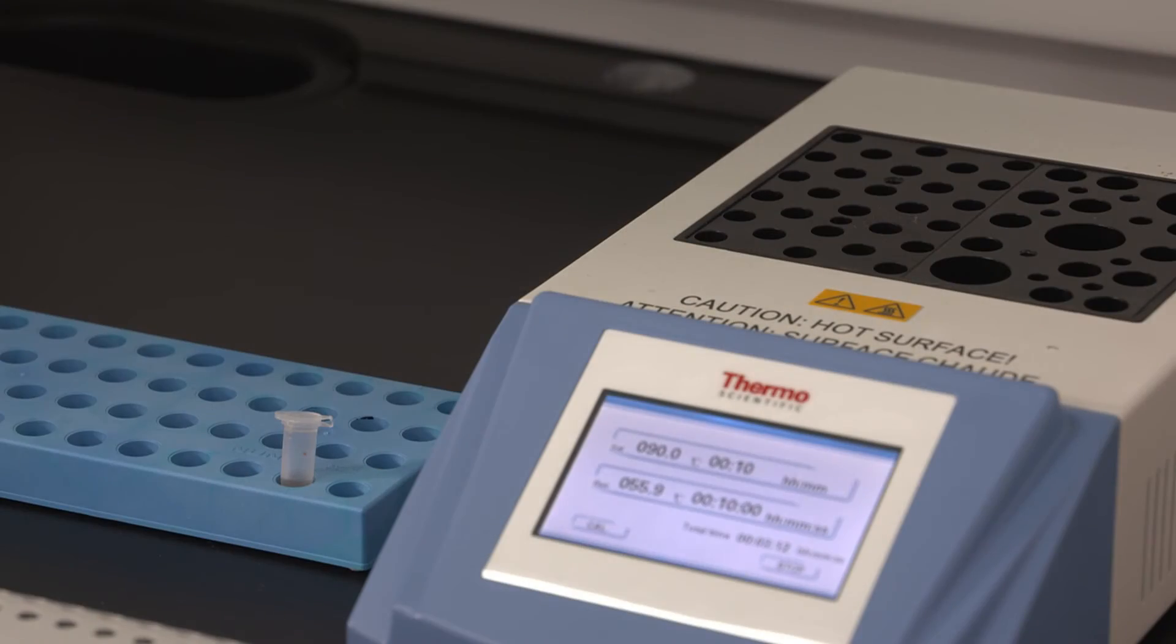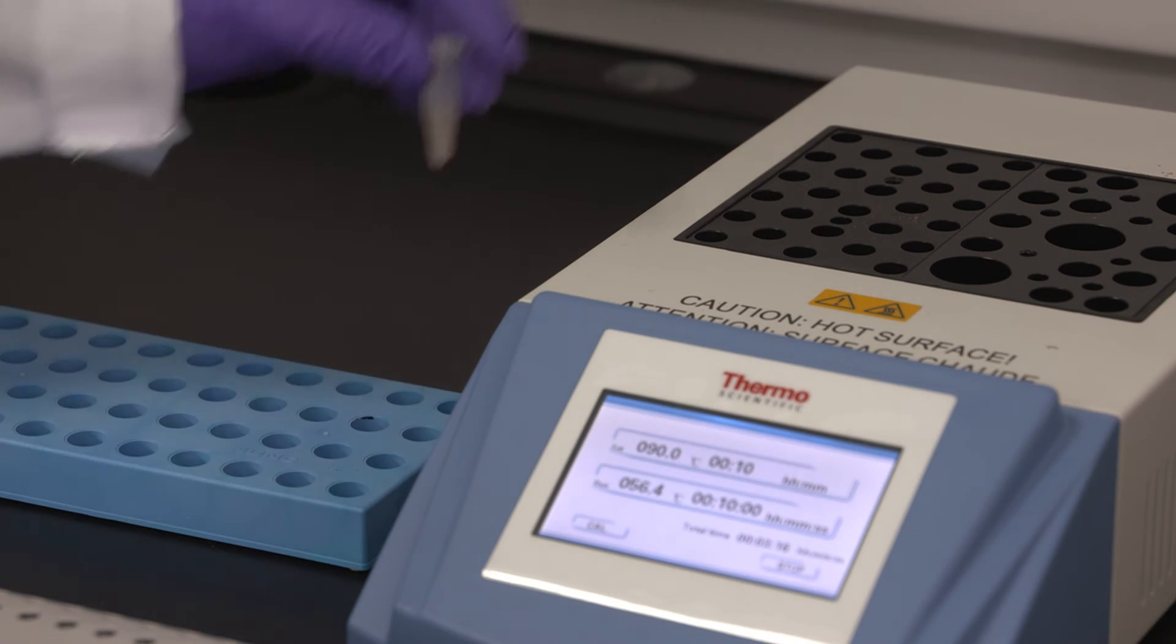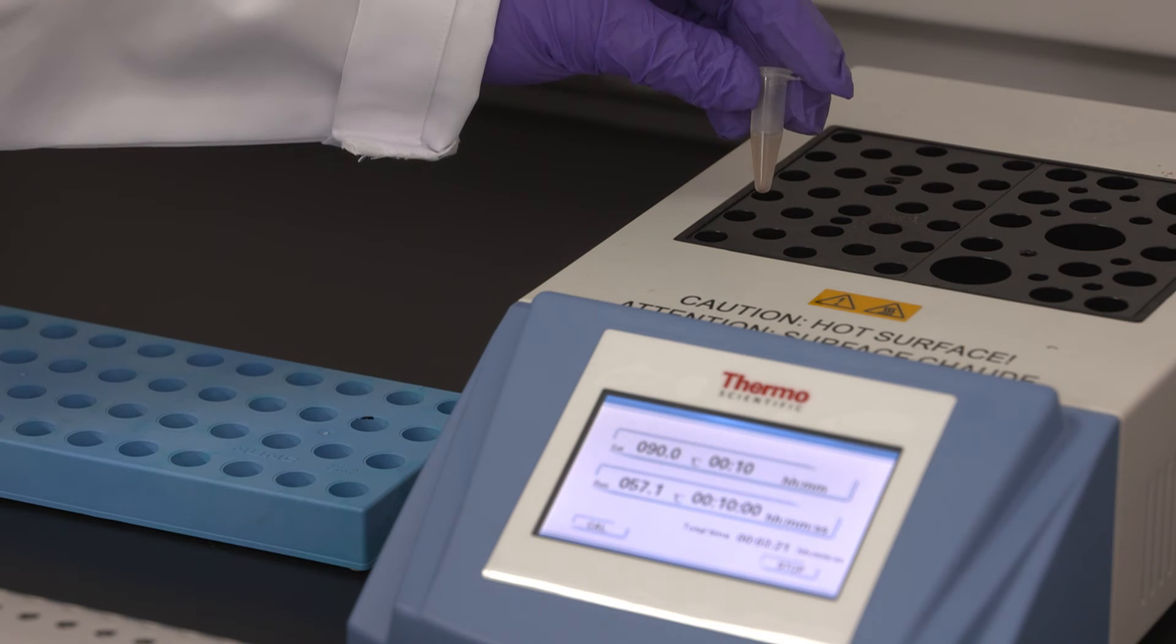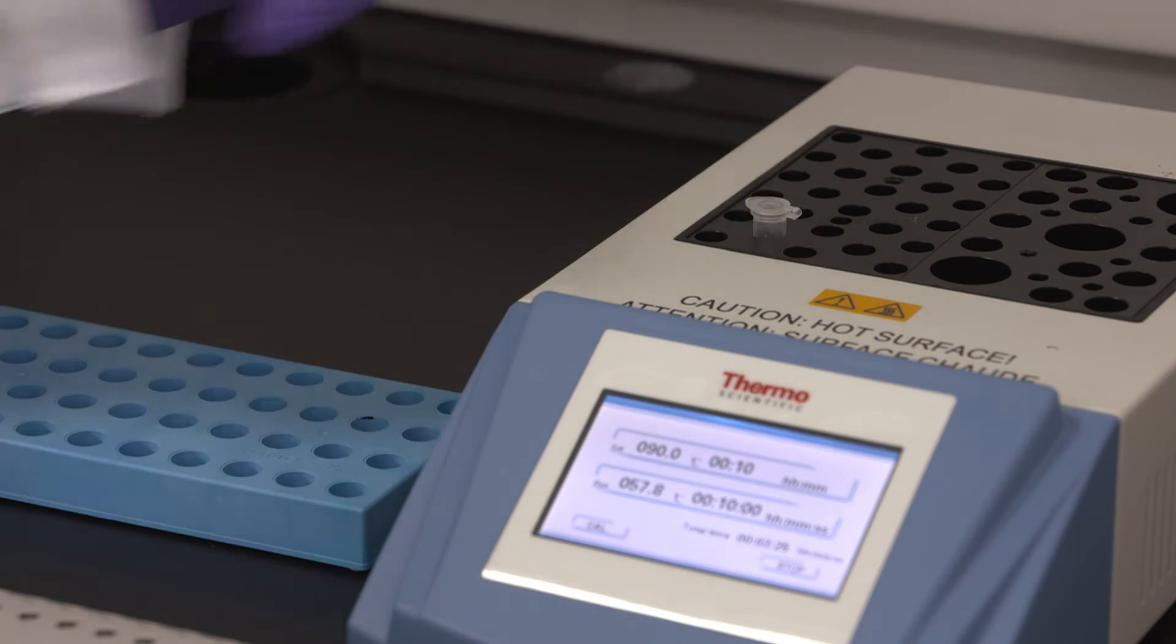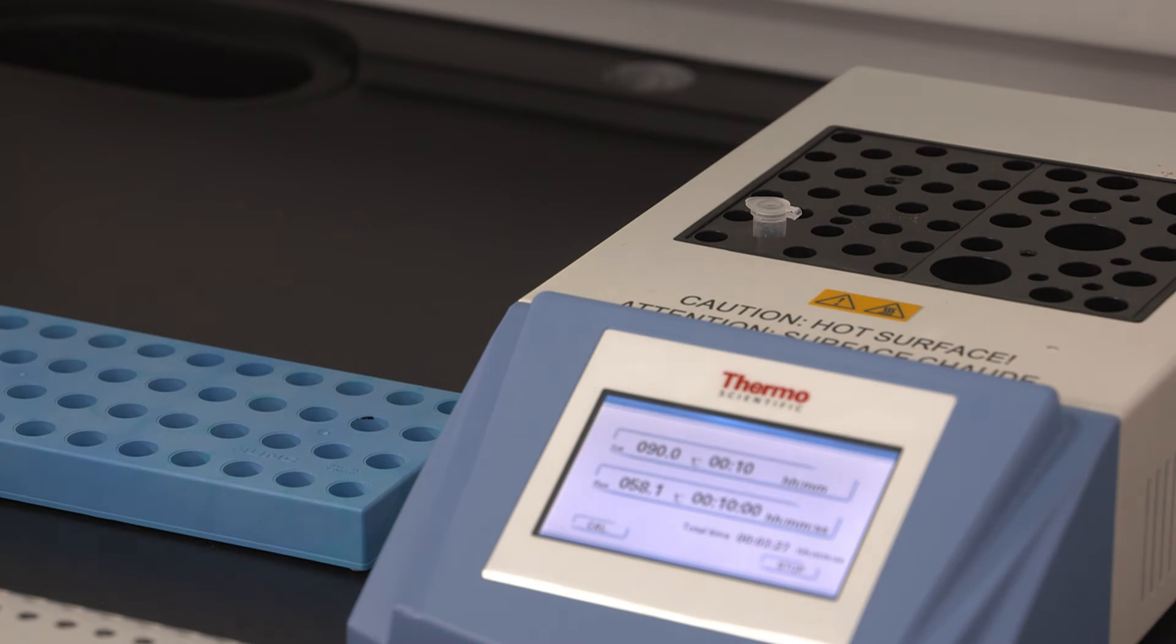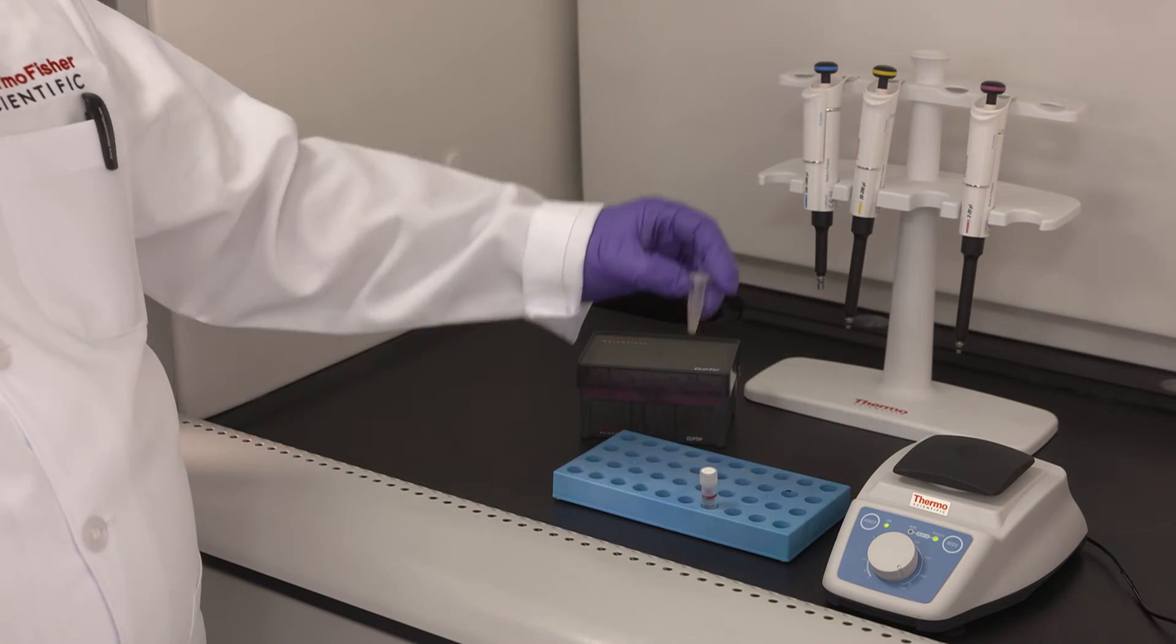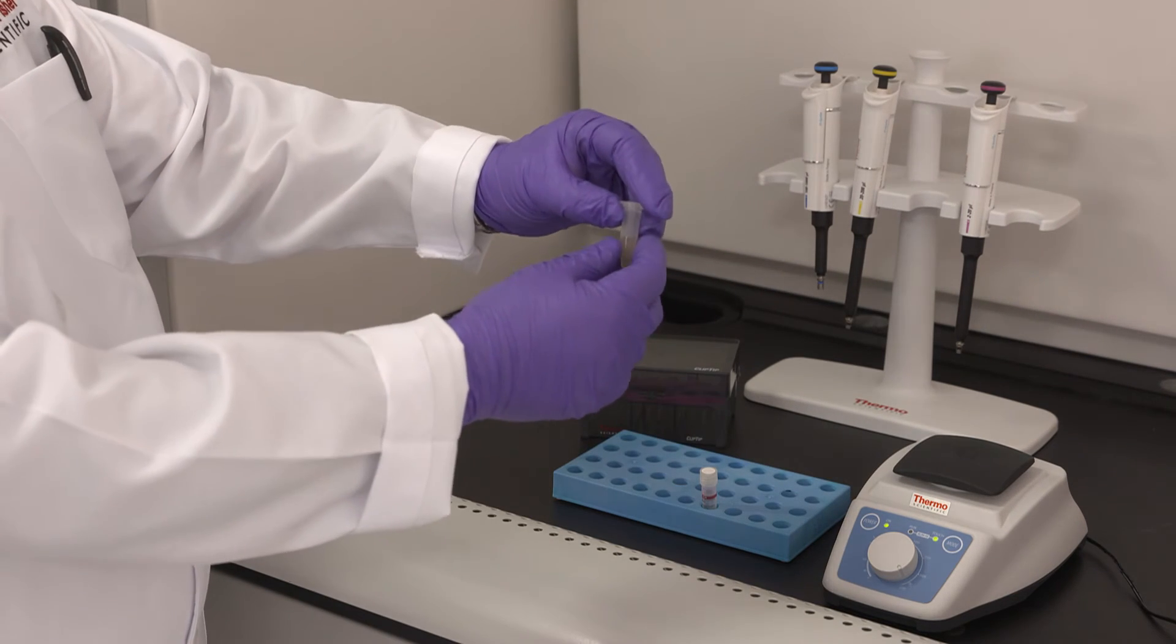Now we have dissolved the pellet in our sample. We will denature the protein by heat and the heater is set at 90 degrees. Normally it's going to take between 5 to 10 minutes. You will see a change in the nature of the solution. You need to remove the sample before it's boiling. Now we are ready to digest the protein in the mixture.